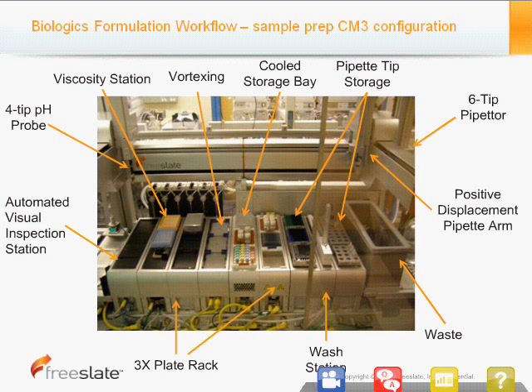Other unit operations we have on the system are vortexing for mixing your samples, as well as tip rack storage and tip waste. And then I'm going to talk briefly about some of the other new tools that we have on this system a little later on.